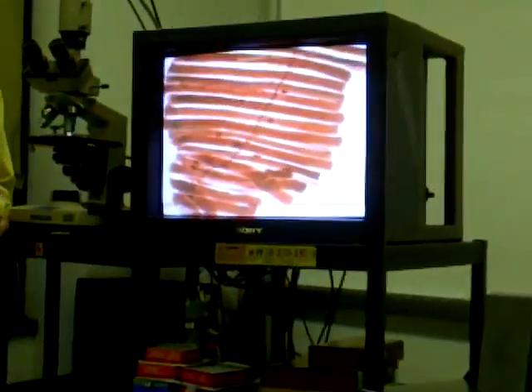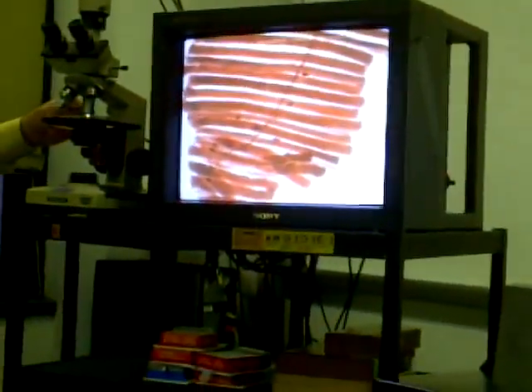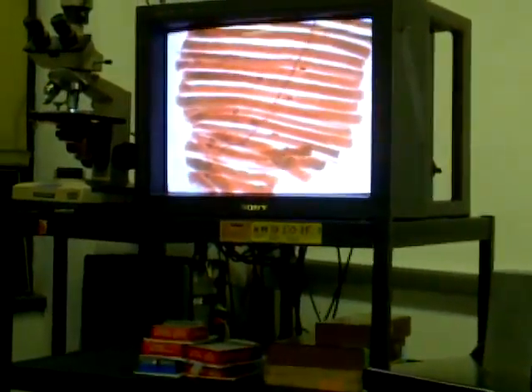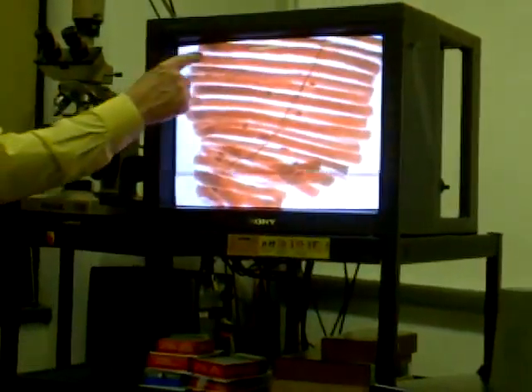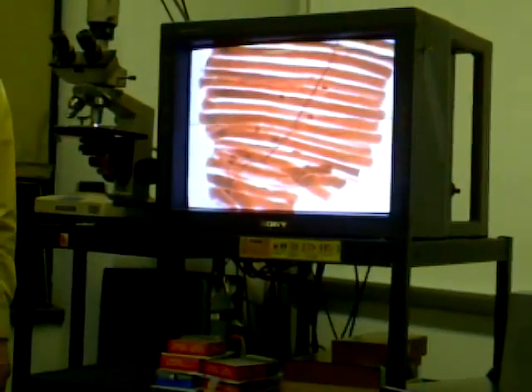Show both of them really well. The muscle cells show up really well, and the motor end organs show up really well. But what's fascinating about it is that here we have, it's only on medium power, and yet it only shows very small pieces of very large cells. So for example, each one of these red-brown stripes is a small piece of what kind of cell?